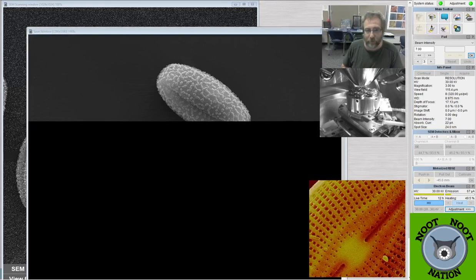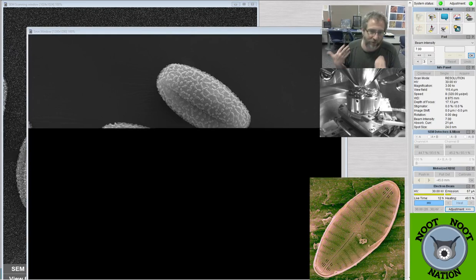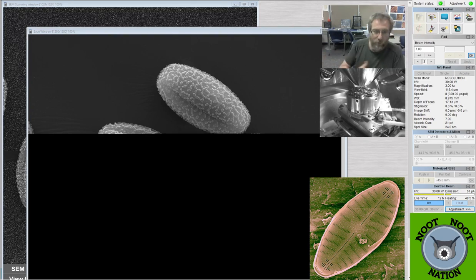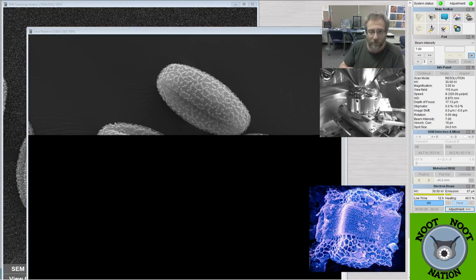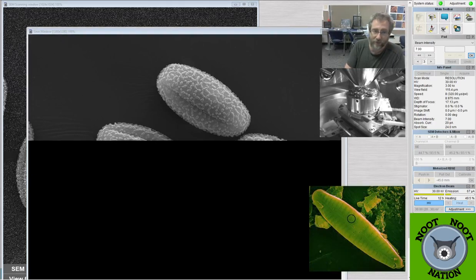So almost no prep. For some of them, I took a picture with my iPhone, and then I used iNaturalist to make sure I had the ID correct. Other ones, I just knew what the flowers were in advance, so I didn't even have to ID them. So yeah, super easy. On Saturday, when I streamed, we looked at pollen and actually went through the whole process of prepping them. I prepped them during the stream, so if you go back and look at the previous stream before this one, I did all the prep live. I didn't collect them live, but I prepped them live.